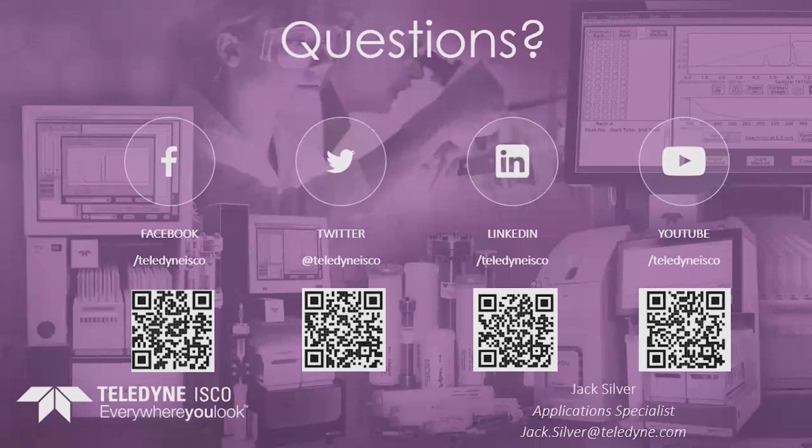We can buy different silicas for the column, right? We have amino as an option, but yeah, you can get different bonded phases, and they do show different selectivities. And so we have silica, we have amino, and we have alumina, and various types of C18. What about alumina? Yes, we do have alumina.